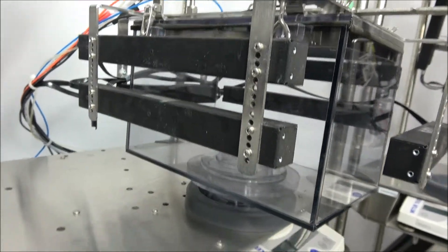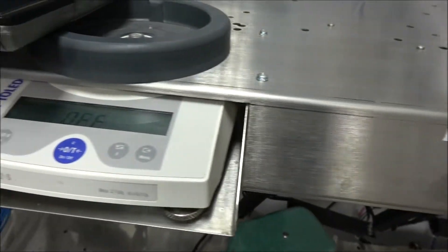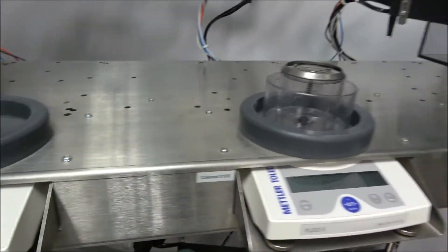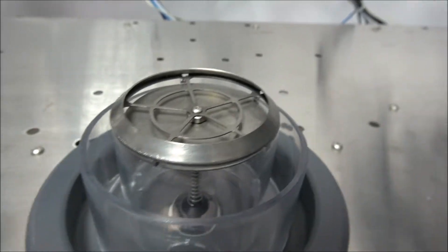The Mettler Toledo balances operate to a resolution of one one-hundredth of a gram and function as intended. The balances serve as a monitor for the total food eaten and can be monitored per serving. Columbus Instruments offers accessories to control feeding and also accounts for foraging and spillage.